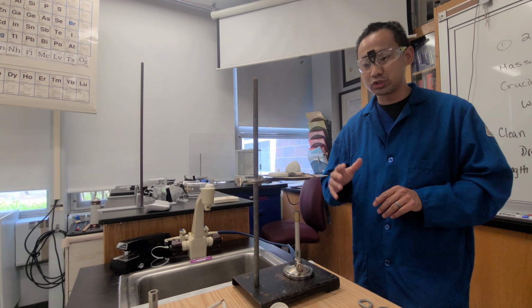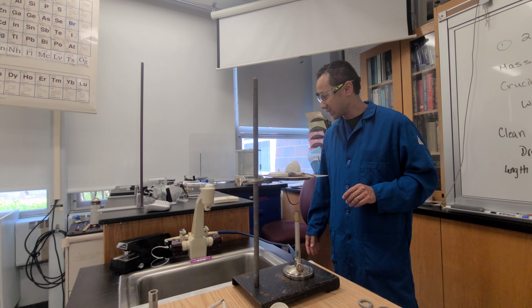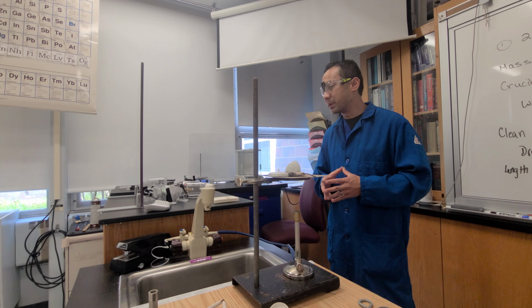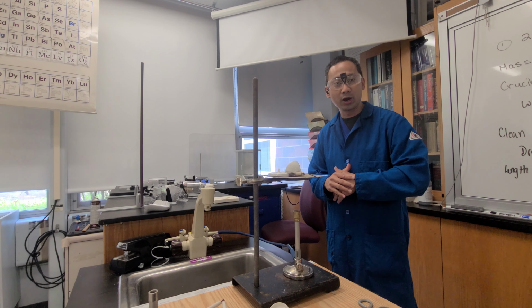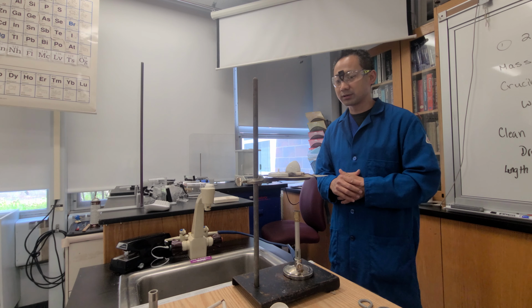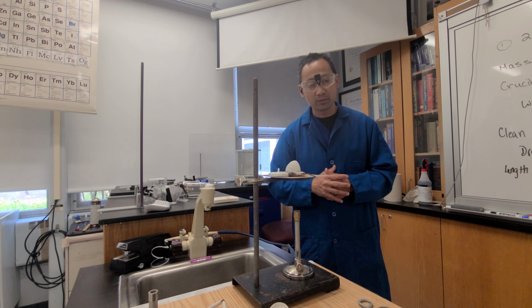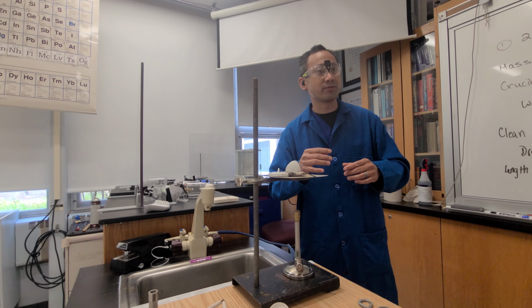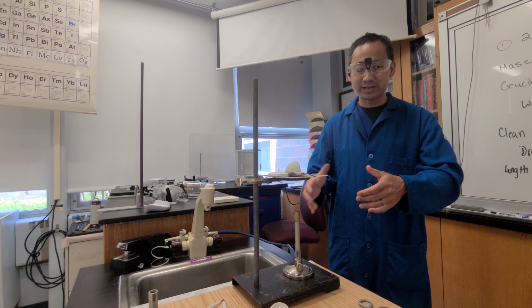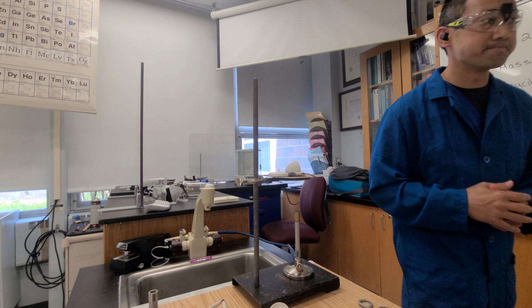I hope you guys excuse me. I should probably be wearing a full set of goggles, right? That's technically what I should be doing. But these are fog-free, and I always weigh the cost-benefit of that. With this particular lab, eye safety, being able to see it as well, and this does have a pretty good wraparound as well. No splashing liquids, pretty much. If anything is going to fall, it's going to fall straight down. Things aren't necessarily going to be coming upwards. There'll be a little bit of smoke, but that's it.